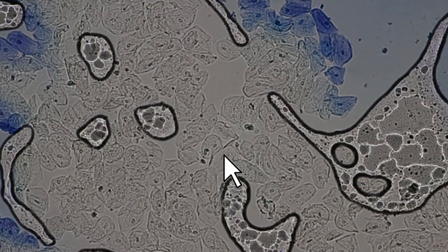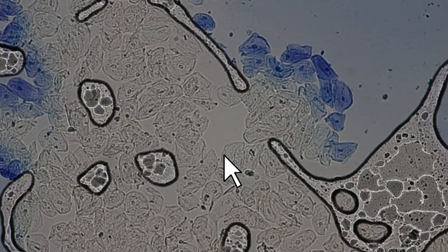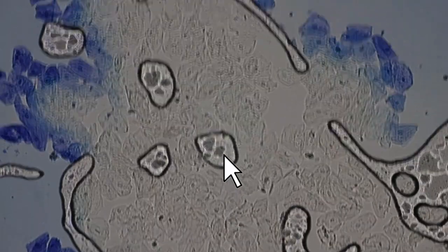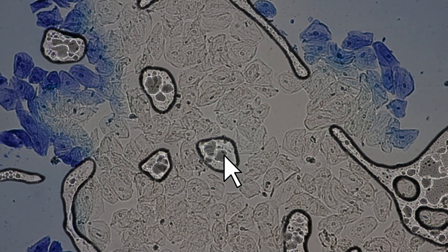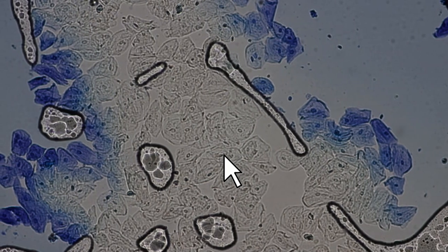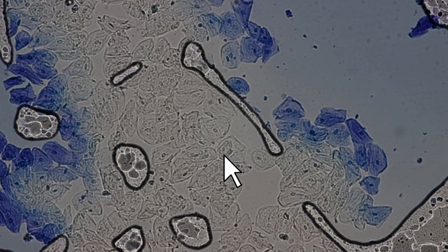But actually, this is kind of interesting, I did not add any water. So why are there bubbles here in the center? This is what confuses me a little bit now. There must be water. This must be the moisture from my mouth, actually, because those cells here are surrounded by liquid. Otherwise, the methylene blue would have soaked in directly.